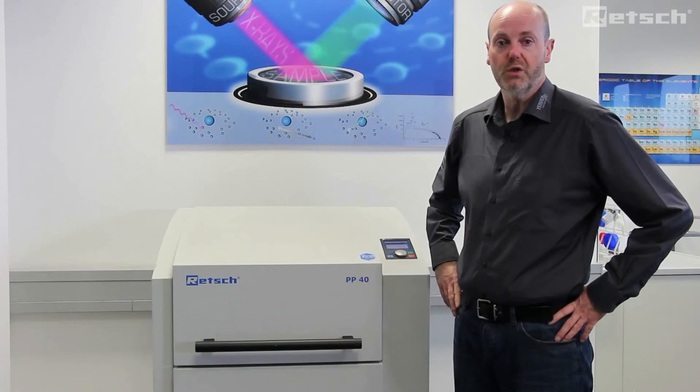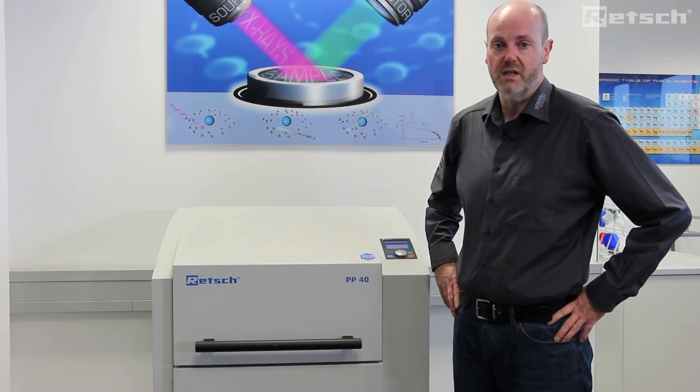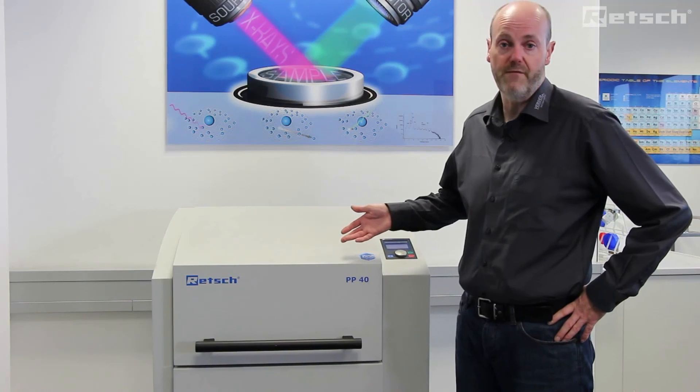I hope you have enjoyed the short introduction to pellet pressing using the automated PP40 pellet press.